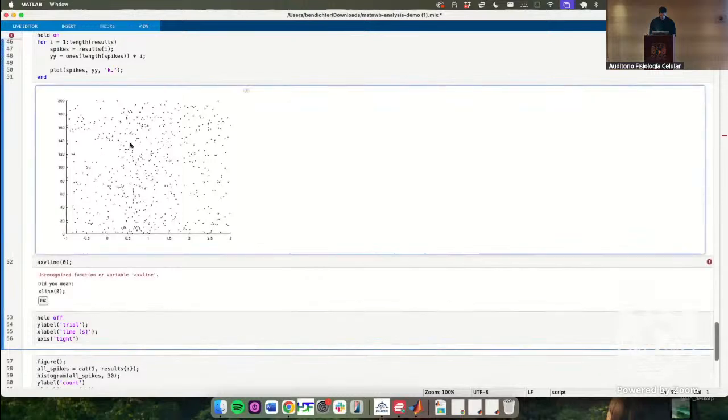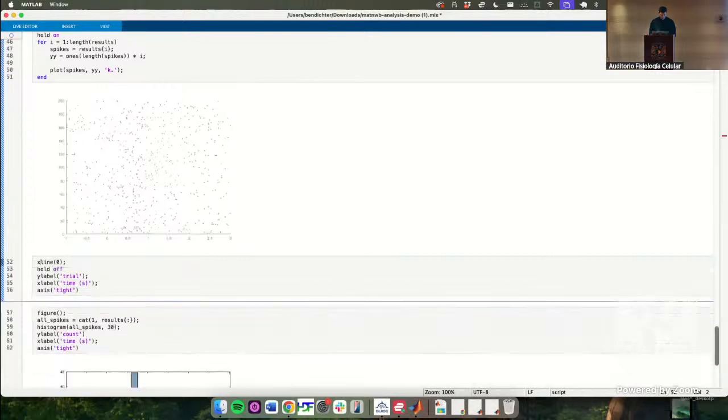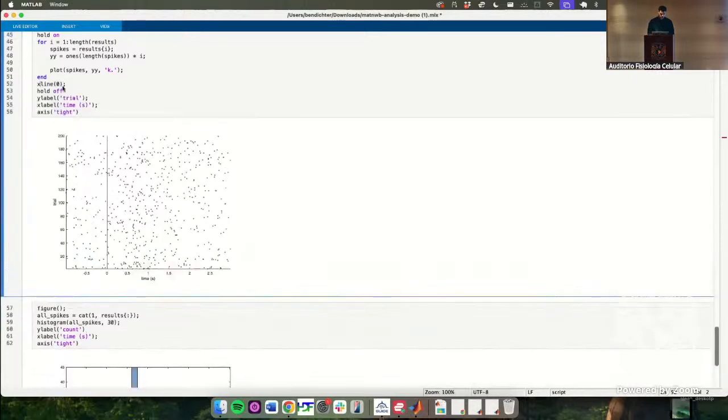No, I forget how to make a line here. There's just line from where to where you want to go. Yeah. Okay. It's X line. X line? Yeah. That's what I want. Yep, thank you. Let's make it red.